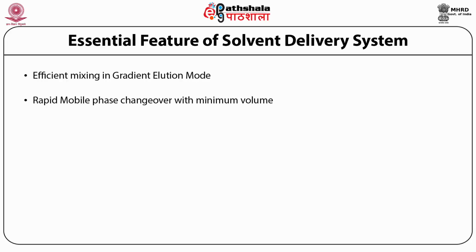In gradient elution mode, the volume or time required for the gradient to pass through the HPLC system is known as system volume. In a chromatographic process that employs a mixture of two solvents as the mobile phase, initially, both the solvents are discharged from the reservoirs separately and are mixed in a desired ratio before the mixture enters the column. The system volume refers to the actual fluid volume from the point the solvents are proportionated. In other words, it is the volume between the point where the gradient is formed and the column inlet.